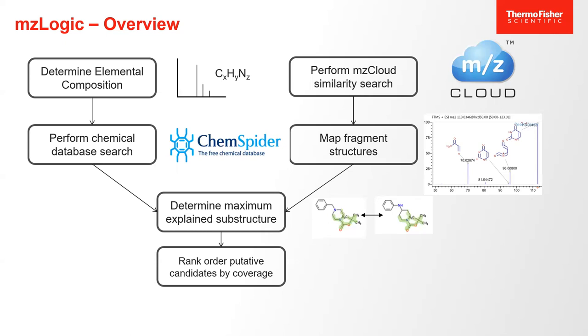And the NMR's got those cute little sidebands on every peak that tell us what? Connectivity. How one piece is attached to another piece. And that's what the mass spec lacks. The mass spec is incredible when we want to say, of these five compounds, which is the correct one? But the mass spec is not a structure builder. Don't ever think you're just going to take an MS2 of a total unknown and you're going to deduce structure from it. That's very, very, very challenging.